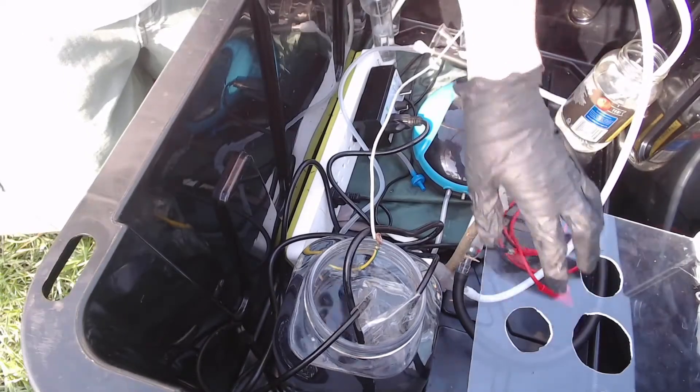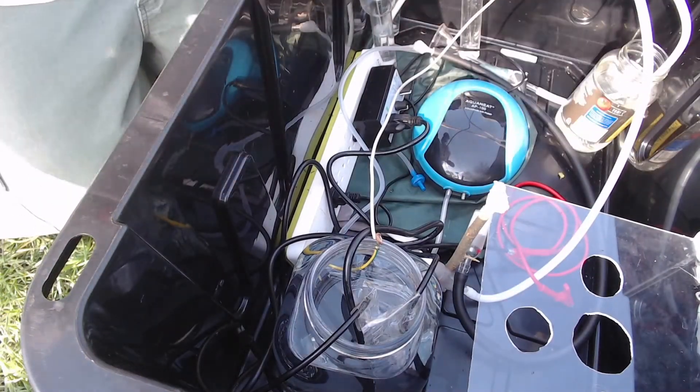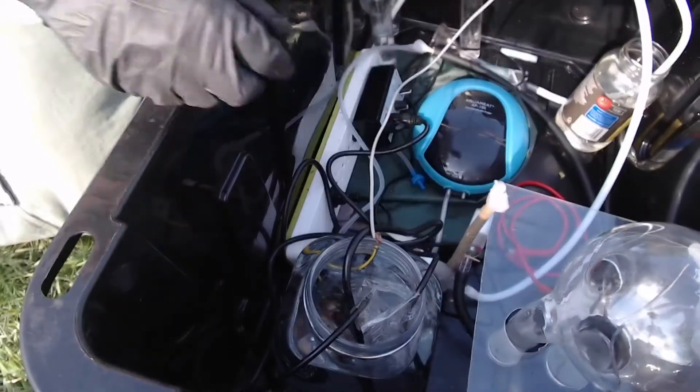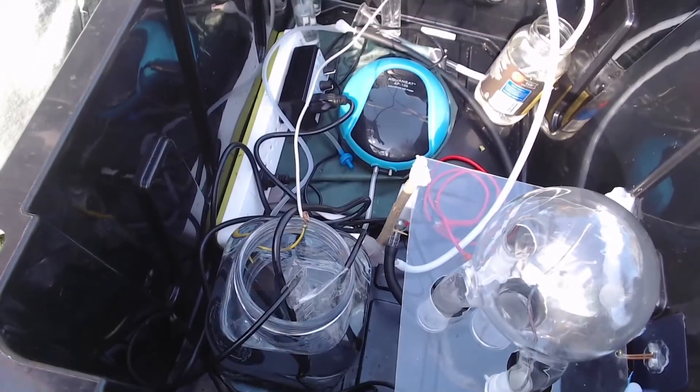I used a piece of acrylic that I had lying around to make a holder for the reaction vessel. Just took a Dremel to it, carved out some holes so I can slide it in. It sits rather nicely — does the job.